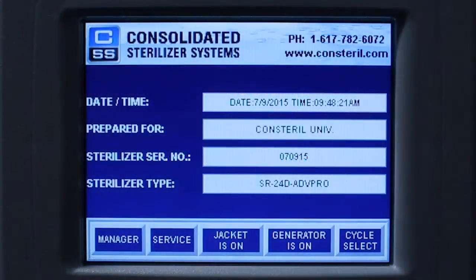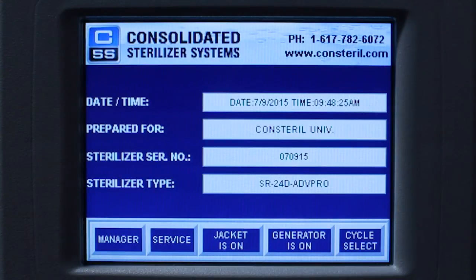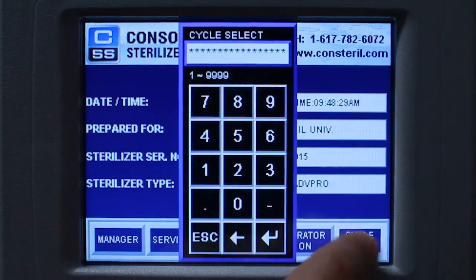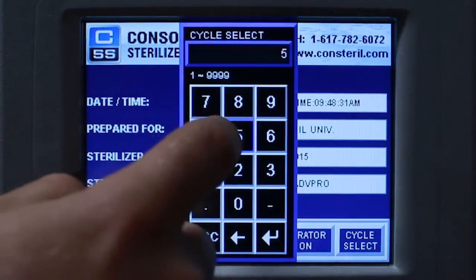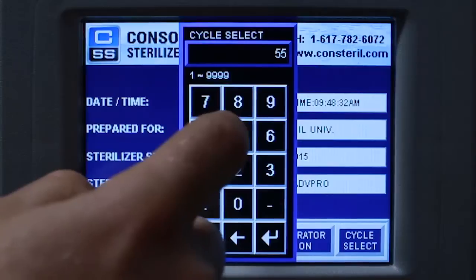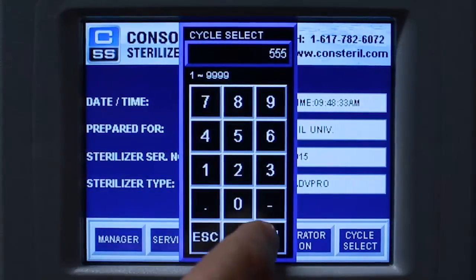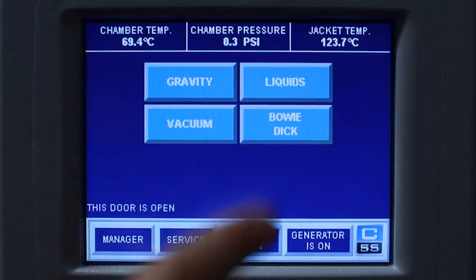To run a Bowie DIC or air removal test cycle on the Advantage Pro control system, press the cycle select button on the main menu. Enter your operator passcode on the number keypad and press the enter key. Select the Bowie DIC cycle.